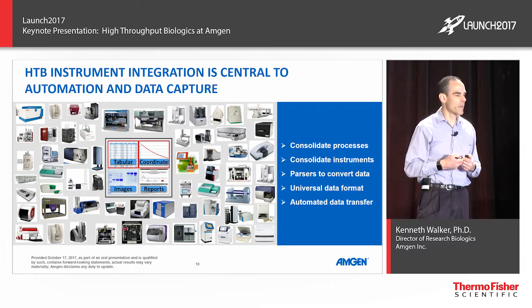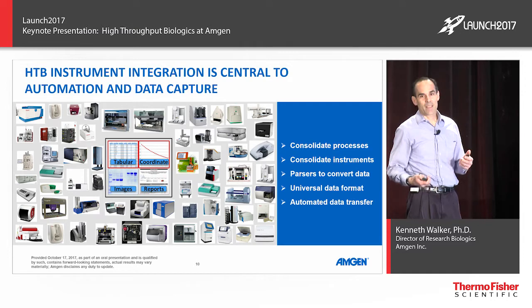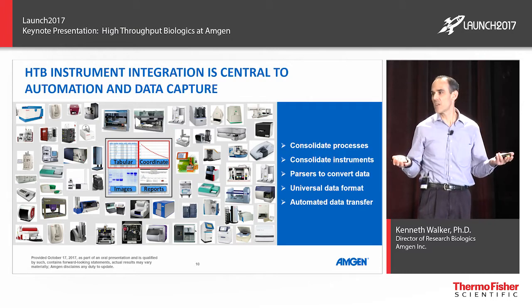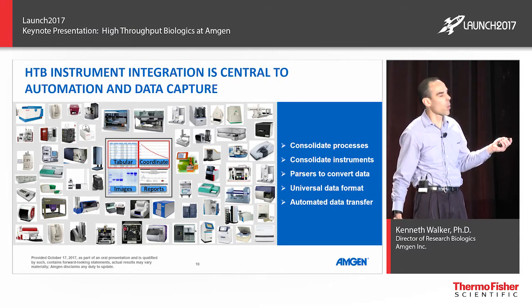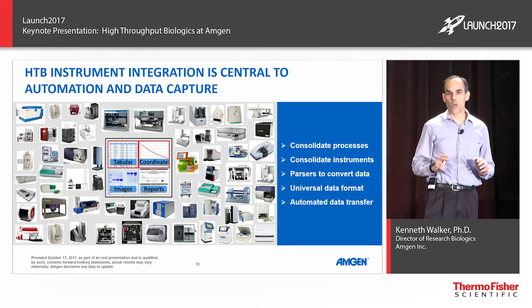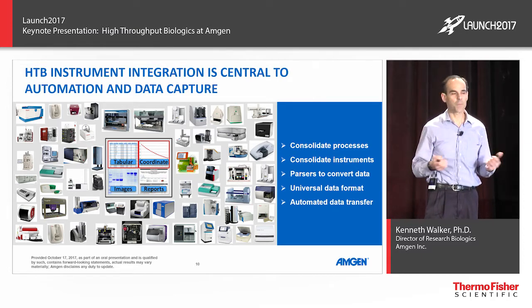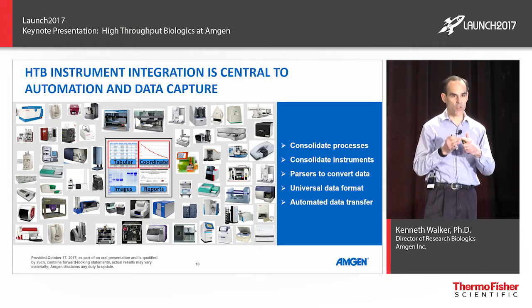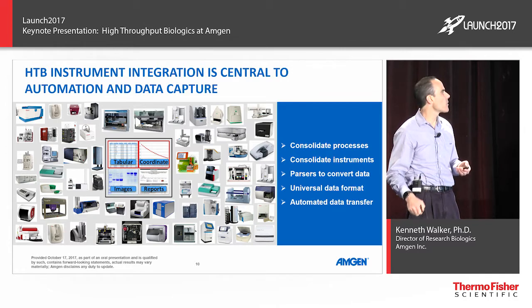A large chunk of the instruments generate that type of data. There are a lot of instruments, though, that generate huge data sets. For instance, chromatography instruments can have tens or hundreds of thousands of points. Of course, we wouldn't want to present the end user with a table of points. That would be very meaningless. So instead, we represent that as coordinate data, as a way of plotting it out in a 2D plot. These are our preferred data types because they are mineable and manipulatable. It's very nice that the end user can take, for instance, these chromatographic plots, and zoom in, resize, replot, and overlay however they want, because it is a universal format. They can just do it in Excel if they wish.